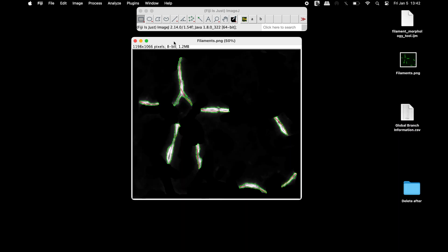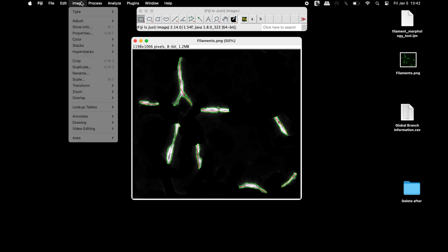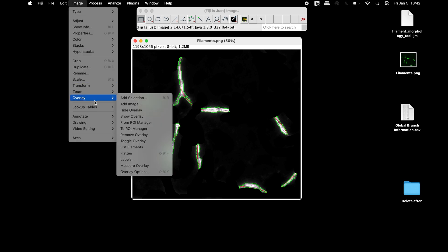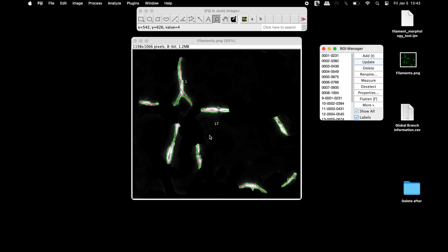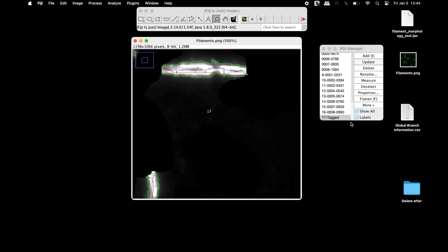To save a copy of the outlined image of the filaments, click on Image, Overlay, and select To ROI Manager. To remove the numbers from the image, simply uncheck the Labels option.